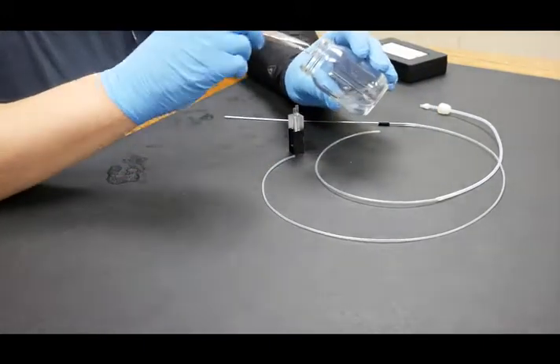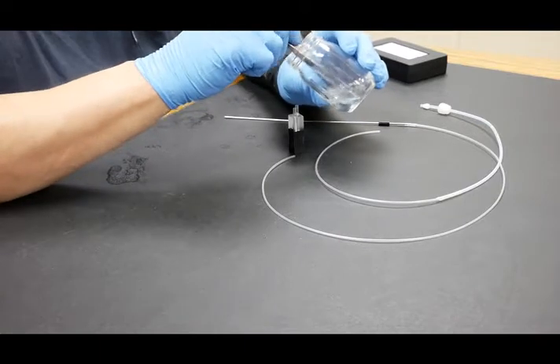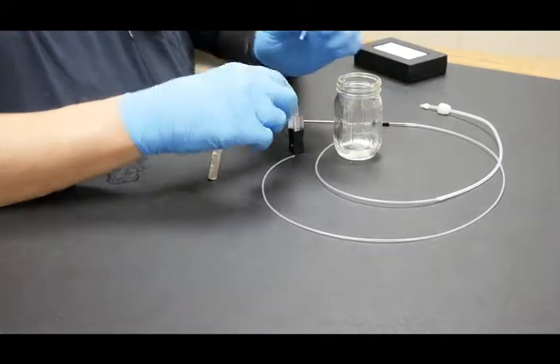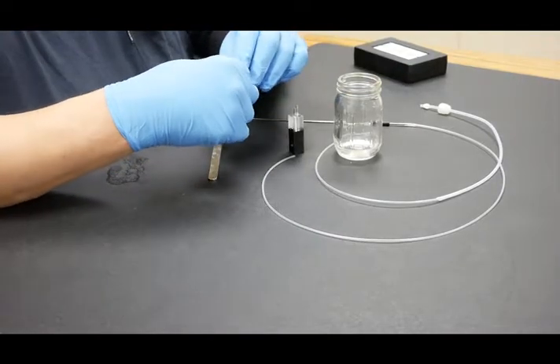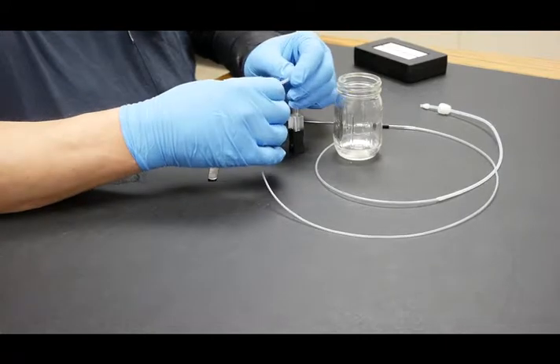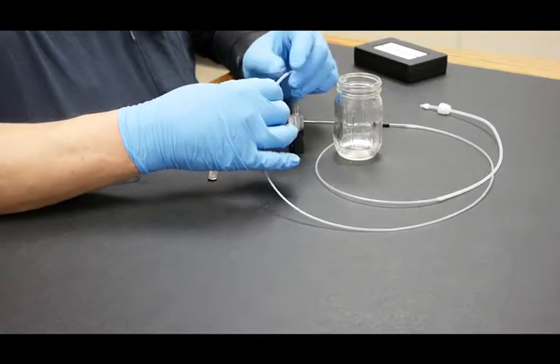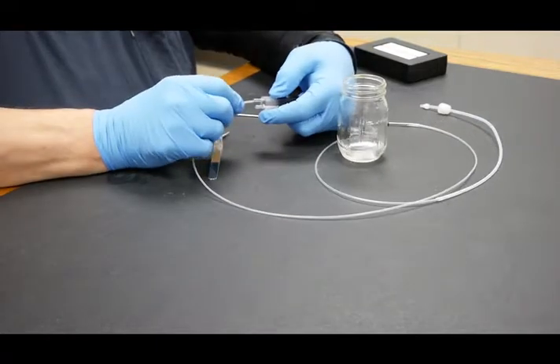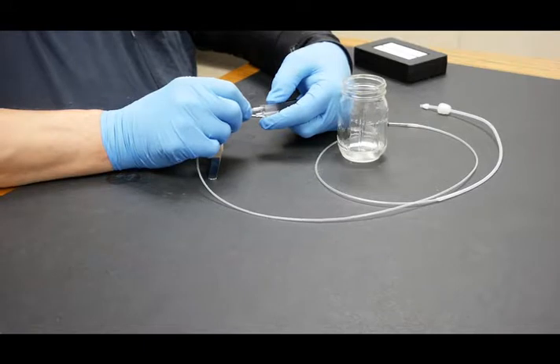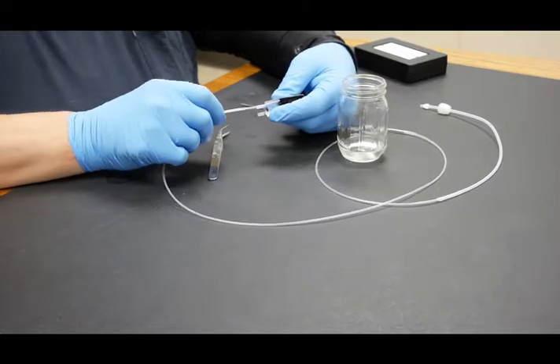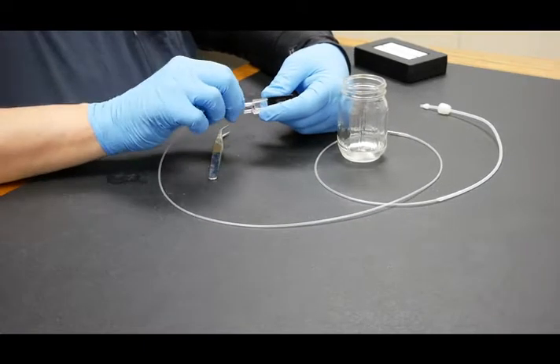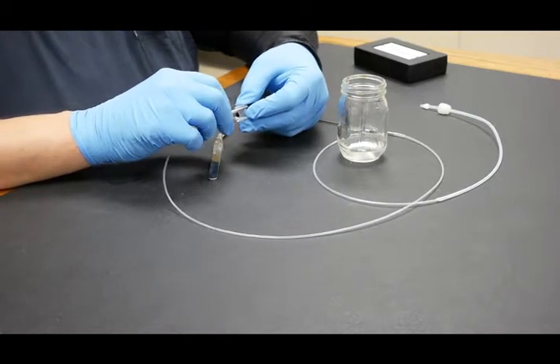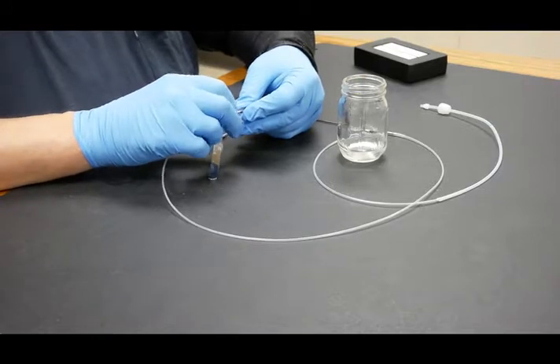Once we've identified that, we can extract a piece of our silastic tubing that's been soaking. This is the thinner wall silastic tubing that we use instead of the heavier wall. That slides over the probe tube. Then we insert the probe tube into the stem of the flow cell.